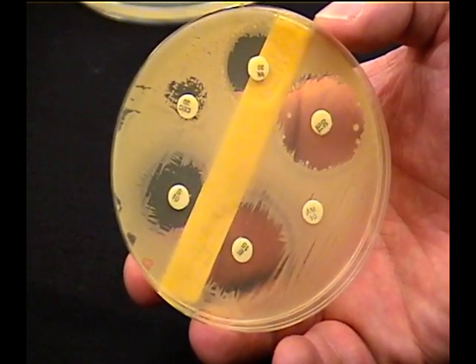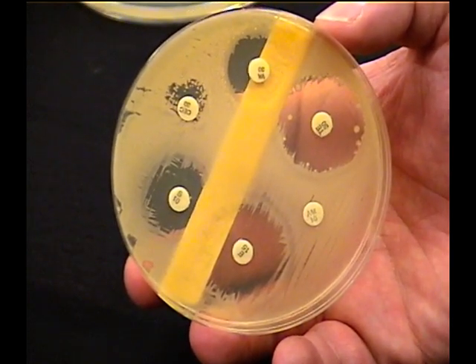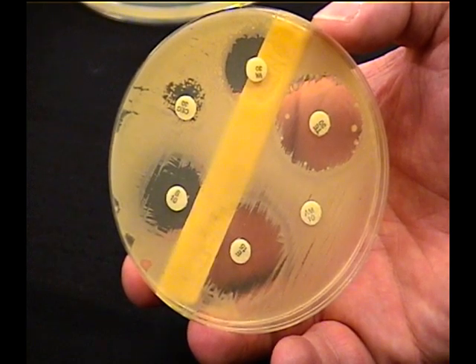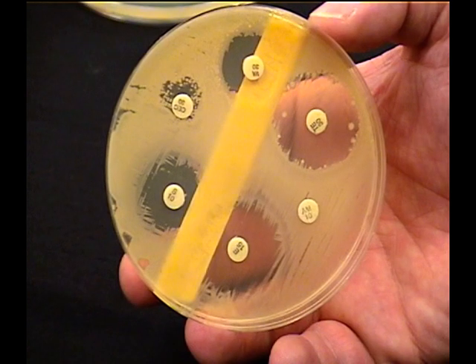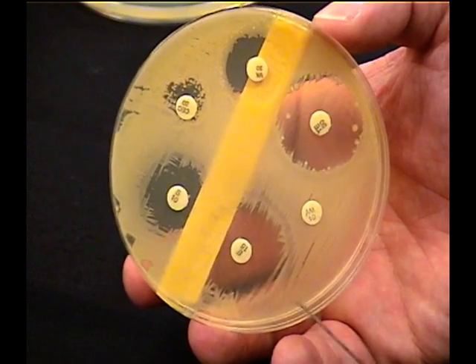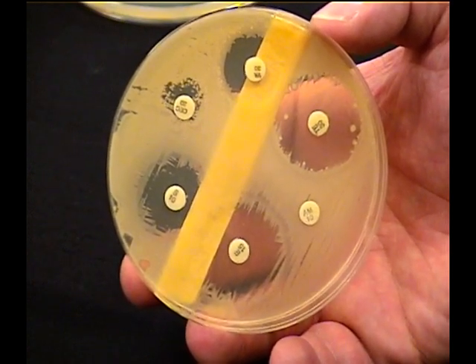Some of the antibiotics are smaller in size than others. The smaller they are, the better they move out from the disc through the media, or through the agar.